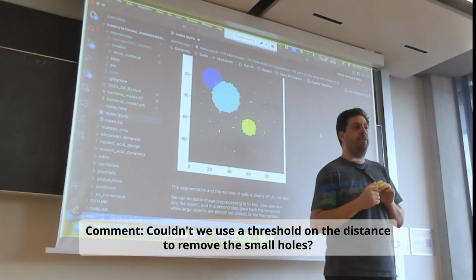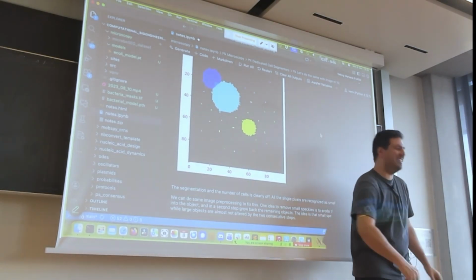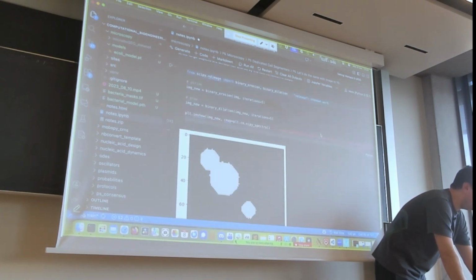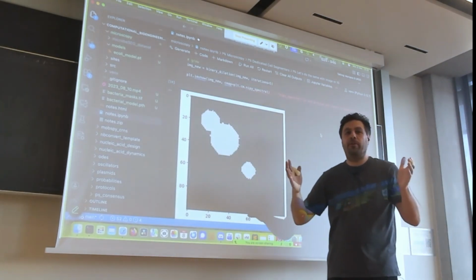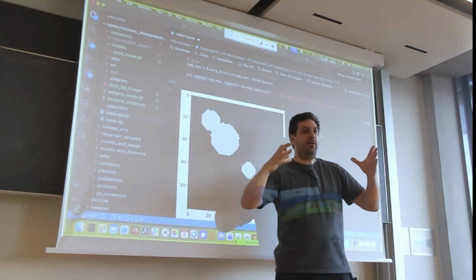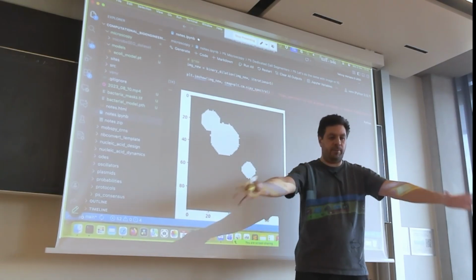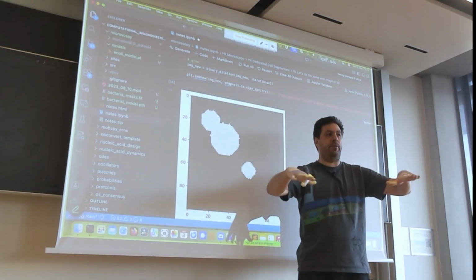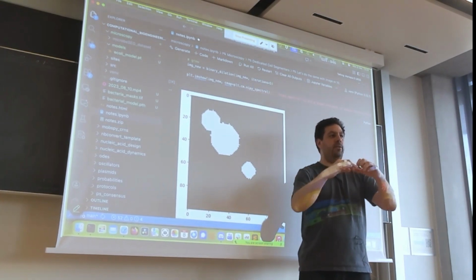Very good idea. And this is exactly what is coming next. What we do is a little bit different, but the concept is exactly the same. If you view it as a sea with some hills inside, we let the sea grow a little bit first. So we let the background eat up a little bit inside the white things.